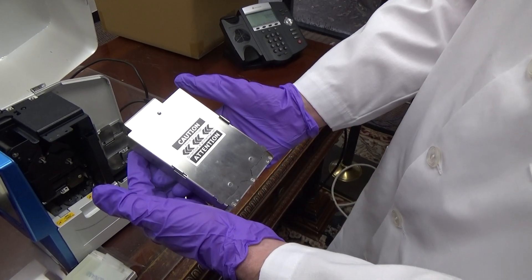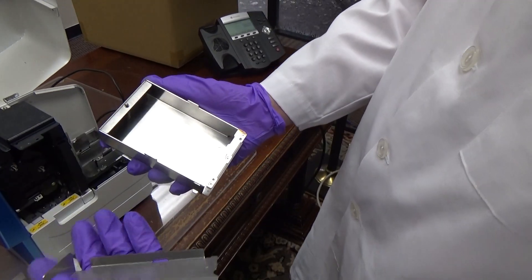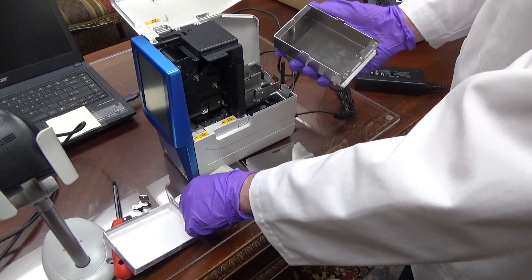As shown is the slide cassette. There are two slide cassettes that come with the ESPO printer. The cassette holds up to 100 slides of your choice, which is a unique feature to this printer.